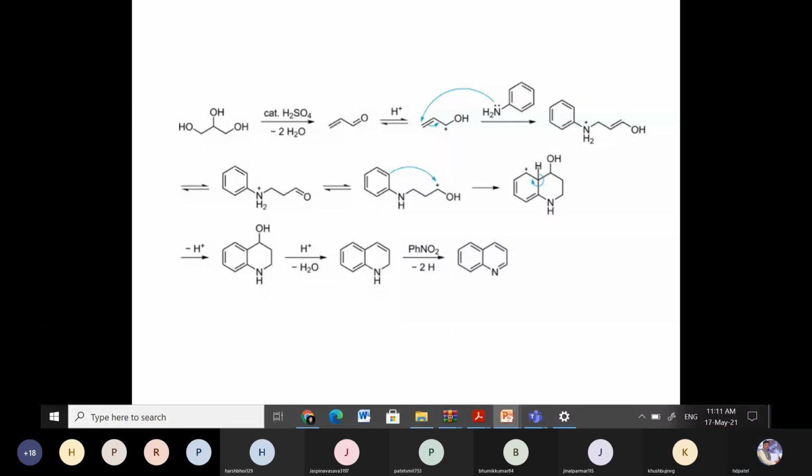After that we will carry out the TLC, and if on TLC your reaction is positive, meaning the reaction is completed, then we can go for the isolation. Now normally in the isolation method, in the normal condition, generally we pour the reaction mixture into a water bath and we get the solid and can separate it out. Here also we can do that, but here an excess amount of nitrobenzene, that is C6H5NO2, is there, which acts as a solvent. Then quinoline is a semi-solid type of compound, and in this reaction aniline is also there, meaning some amount of unreacted aniline is also there.